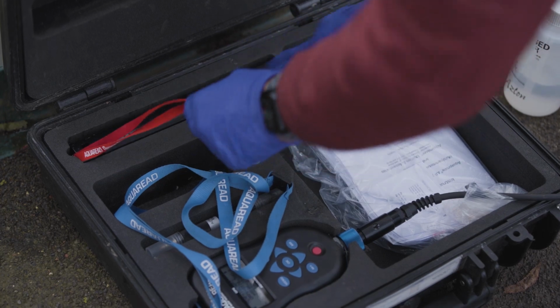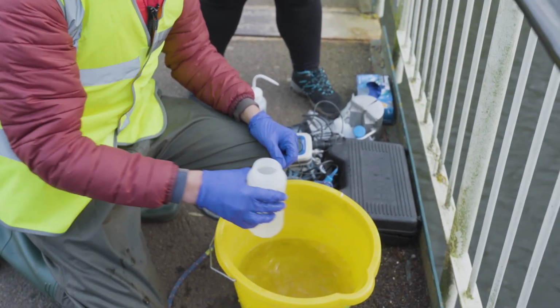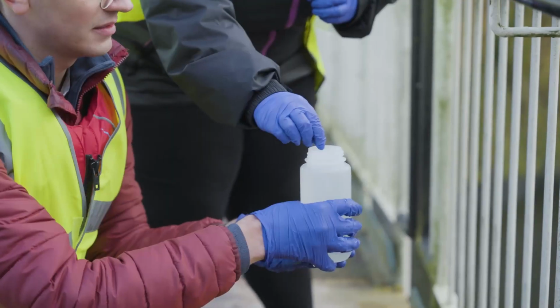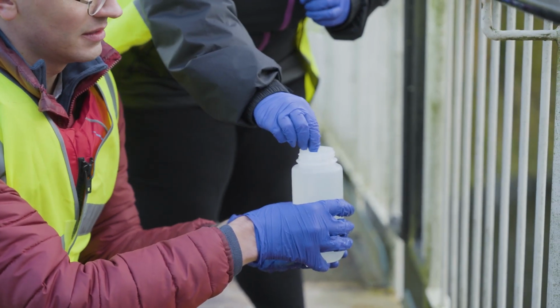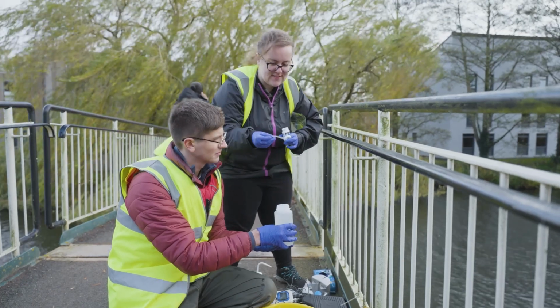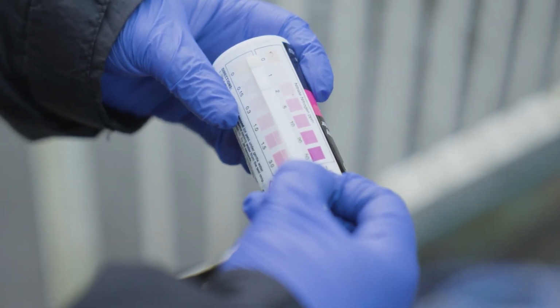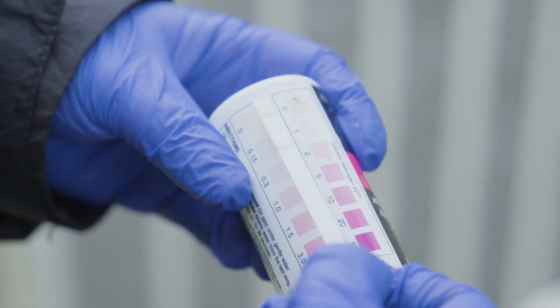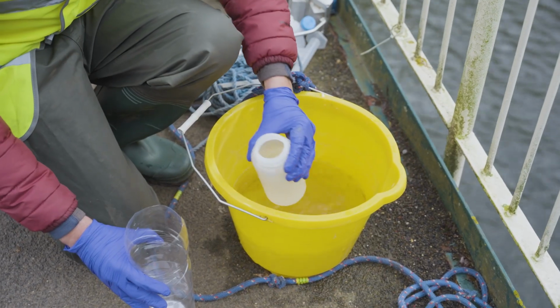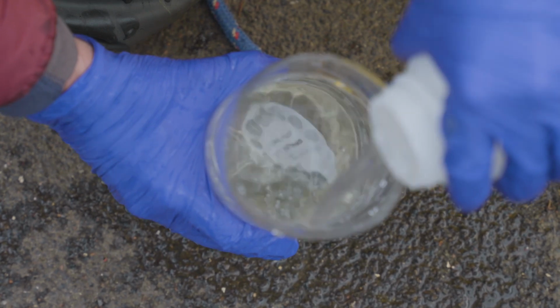Simple test strips can also be used. While less accurate than a sonde, a range of strips are available that provide information on things like pH and metal, nitrate and ammonia concentrations of a water sample. Dip the strip into your collected sample, then wait for the appropriate time before comparing the color of your strip to the color key on the packaging. Turbidity could also be measured, if appropriate, using a simple method such as the Secchi disc method or the opal scale.